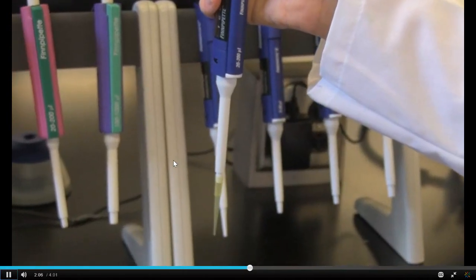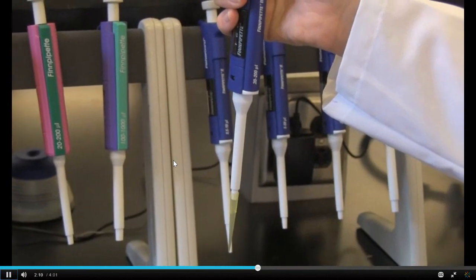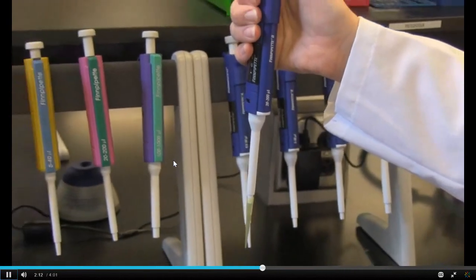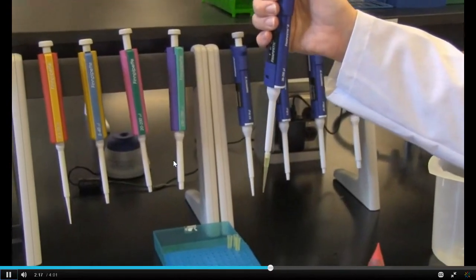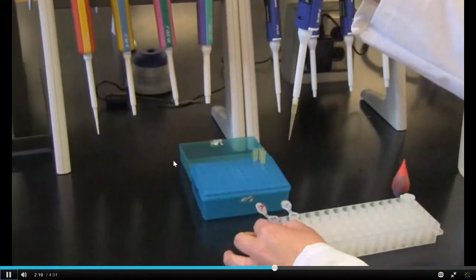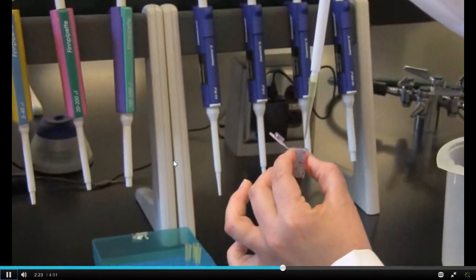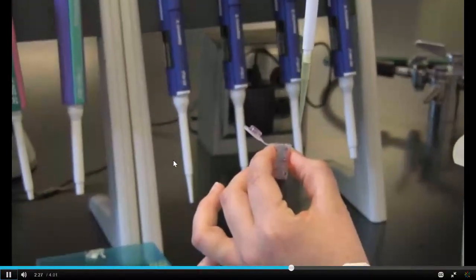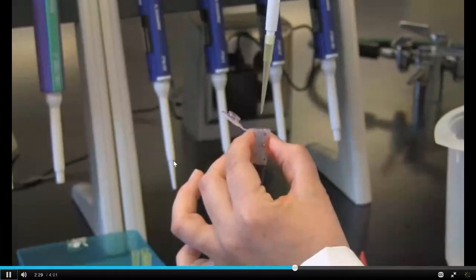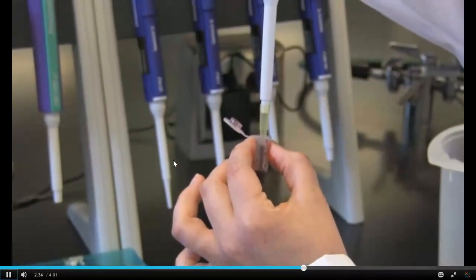This will cause the end of the tips to bend and not be able to draw up liquid. Keeping the micropipette perpendicular to the liquid, draw up 100 microliters from tube 1 and transfer into tube 2. In order to do this, you will depress the plunger to the first stop. Place the tip into the liquid and then gently release in order to draw up liquid. If you've done this correctly, there should not be any air at the end of the micropipette tip.